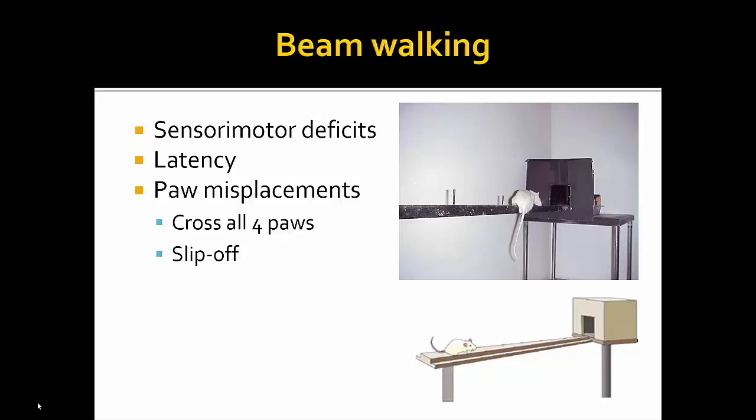I mean, you could have this jet lag kind of phenomena, but if you make it all the same, you will compensate. Don't run some of your animals at night and some of your animals in the morning and some of your animals middle of the day. Or if you do that, you need to make sure it's sort of randomized, so not the same animal gets run in the morning every day, or same animal gets run in the afternoon, but you sort of randomize it, so you get an idea overall if you're seeing some sort of effect like that.